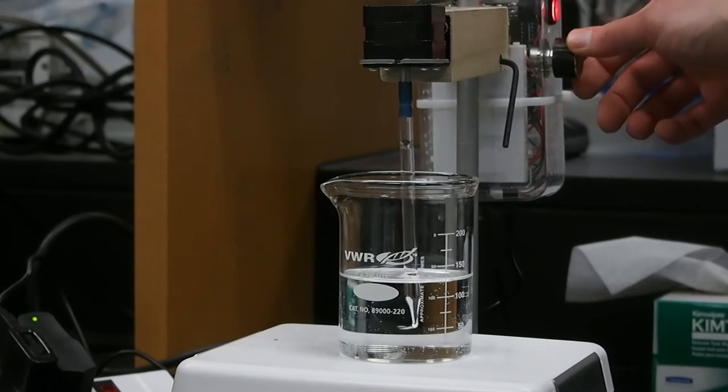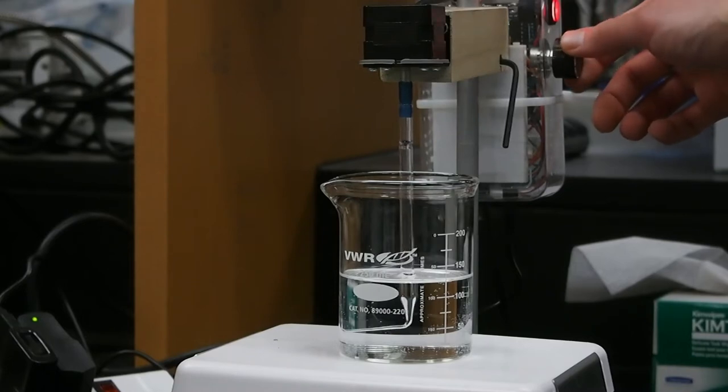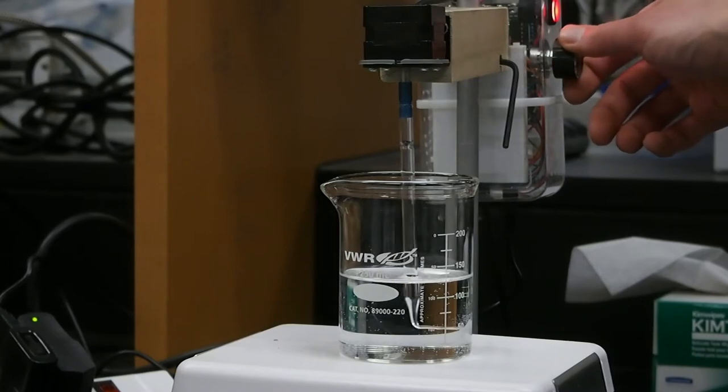I've built this device in order to standardize a part of my methods. With this device you can apply consistent stirring speeds to all of my samples, which eliminates experimenter bias when the solutions are stirred by hand.